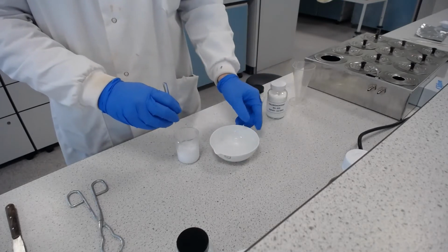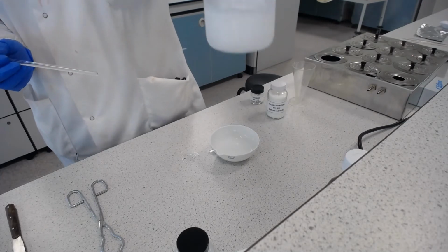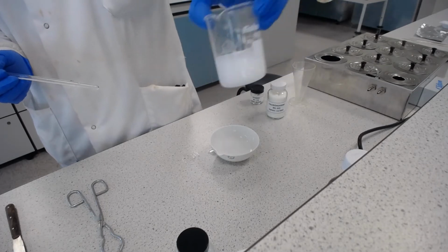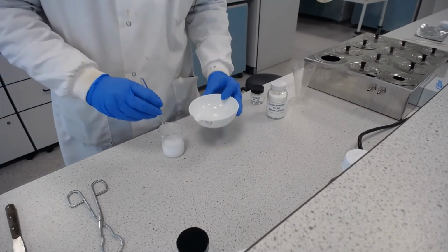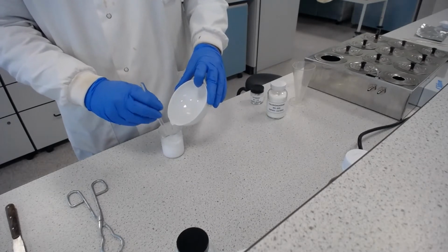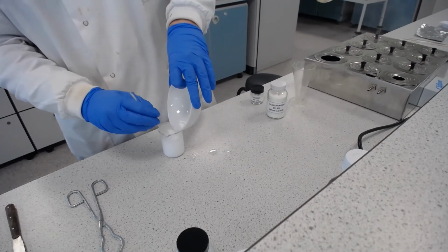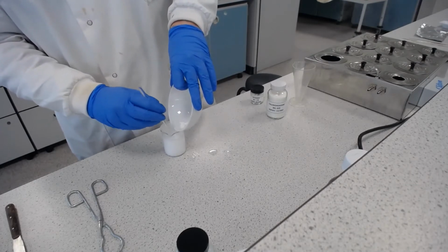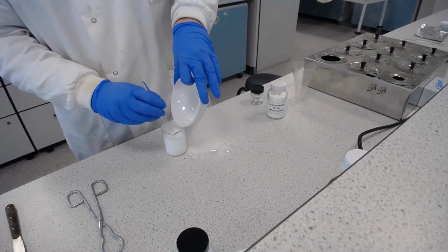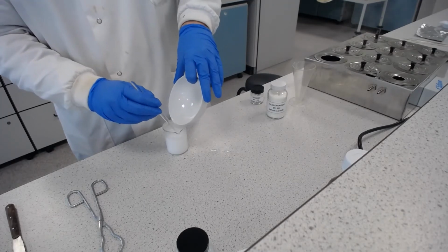Now, I've just added a very small amount of the oil phase into the water, and already we can see we have got a very white, milky looking liquid, which suggests, as I'm sure you know, that we have an emulsion. From first year labs, you should remember that. And given that we're adding the oil to the water and we're making a cream, have a think about whether that is going to be a water and oil or an oil and water emulsion.